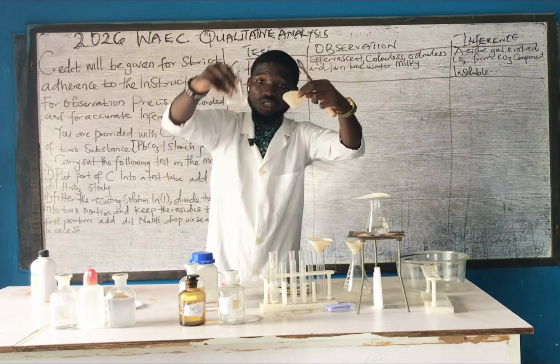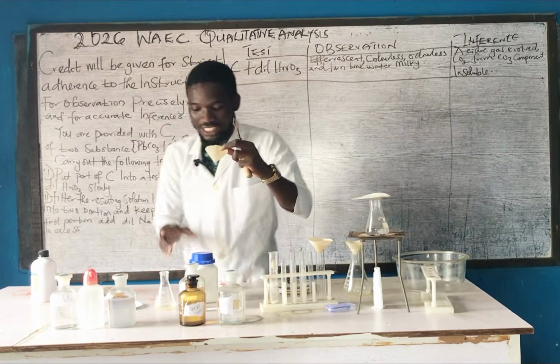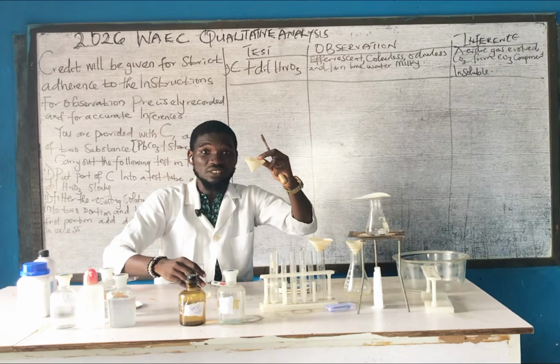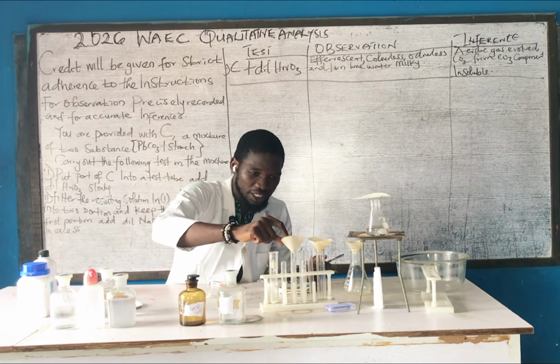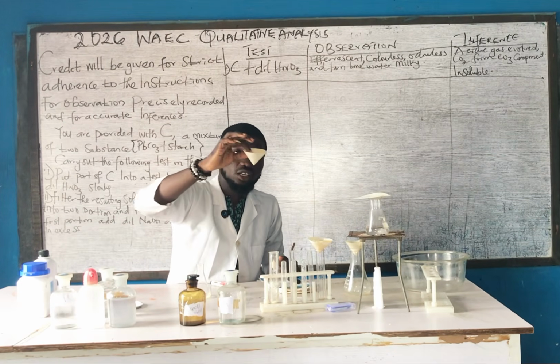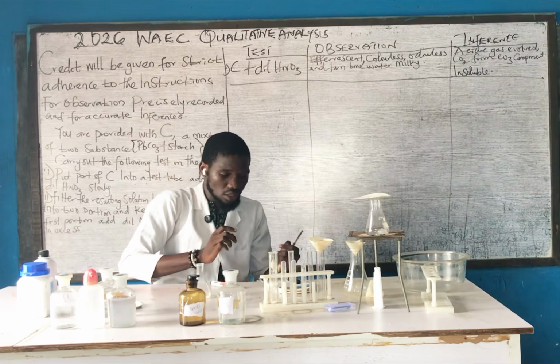This is the residue, while here we have the filtrate. As a teacher or a student out there, I will advise you to pay maximum attention to what you want to do. Please, I'm going to keep this residue like this.